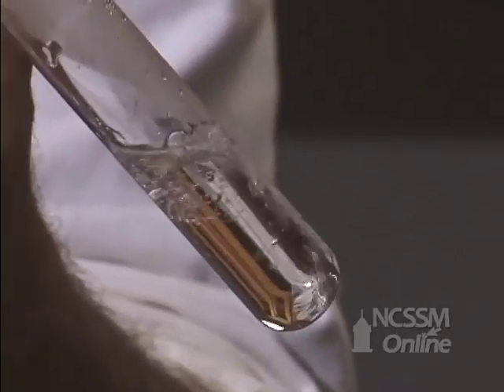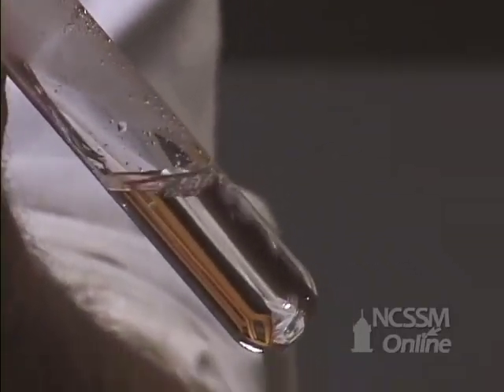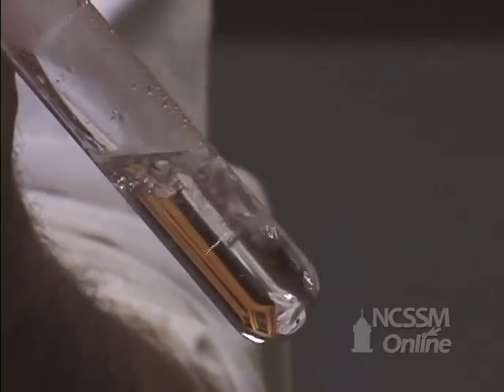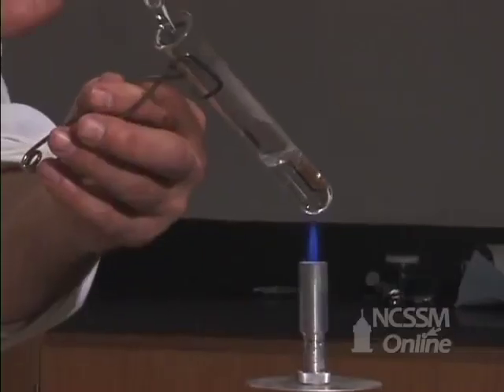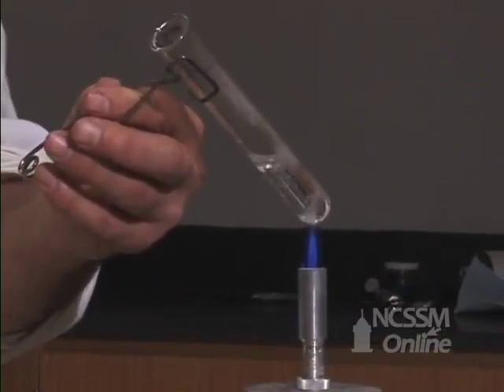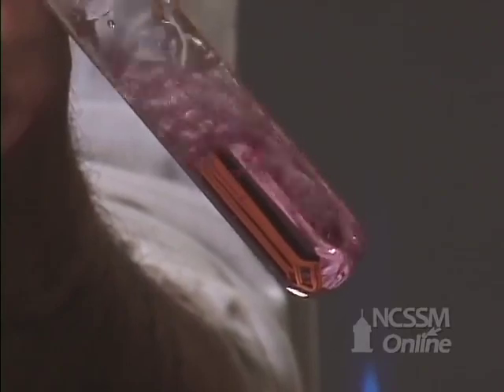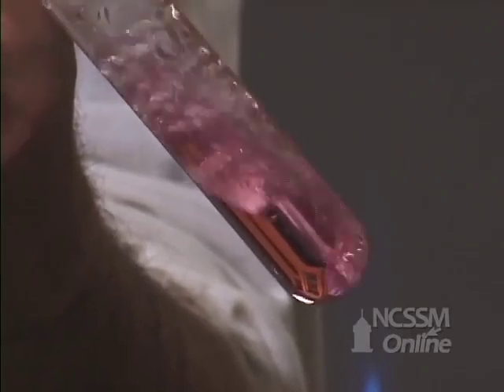The solution will turn purple over a period of time as small amounts of magnesium hydroxide are produced. In order to demonstrate that we're getting a reaction, we'll add some phenolphthalein to the test tube. The solution will turn purple due to the formation of magnesium hydroxide.